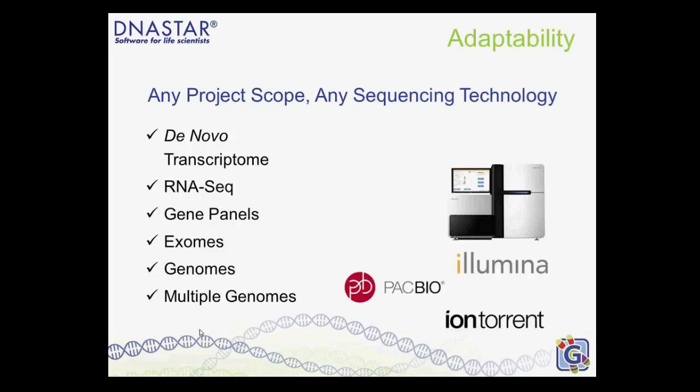We'll also start to see some long-read technologies in the future, and we are looking towards nanopore and developing algorithms to support nanopore. And of course, there's support for PacBio and Ion Torrent as well. But today it's going to be focused on Illumina data.